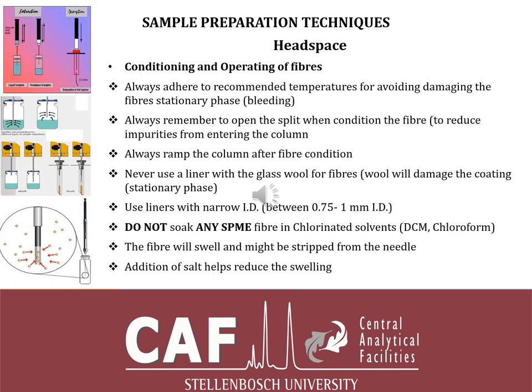Also, never ever use a liner with glass wool, because that will definitely damage the coating on the stationary phase of the fiber. And when working with SPMEs, bearing in mind that you're already working with a very minute sample, because it's on the film of the fiber, the liner that one has to use has to be a narrow bore liner. Anything between 0.75 to 1 millimeter. Sometimes you can even go to 2 millimeter internal diameter for the liner.